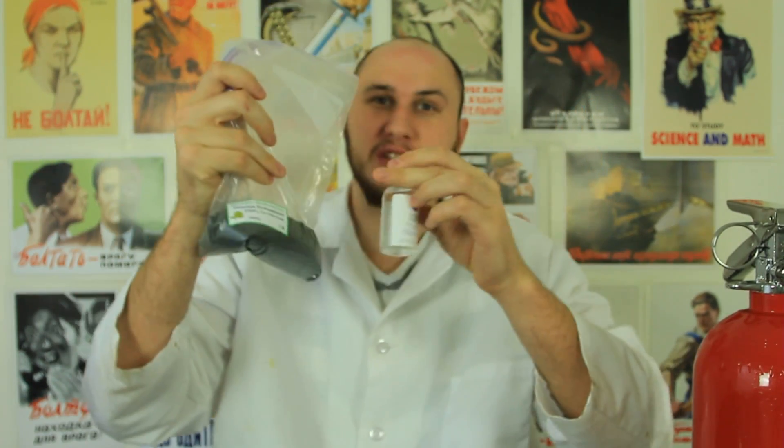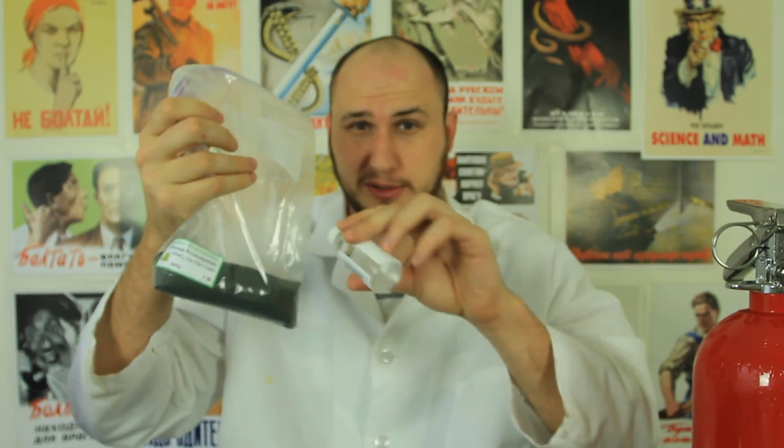Alright guys, that's pretty much it. Don't you think science is awesome? How amazing it was. So, if you have these two chemicals, do not store them together. Because you know what's gonna happen — if this thing gets spilled on that, it will just explode and your laboratory will just get on fire.